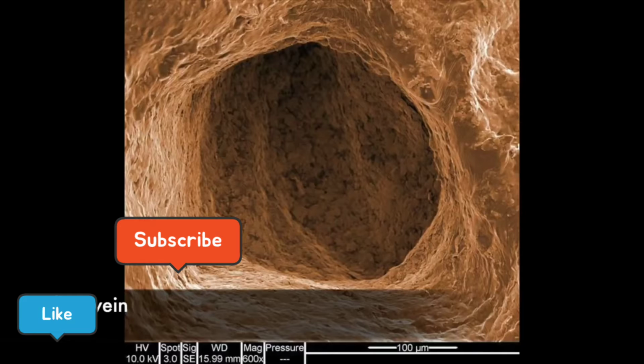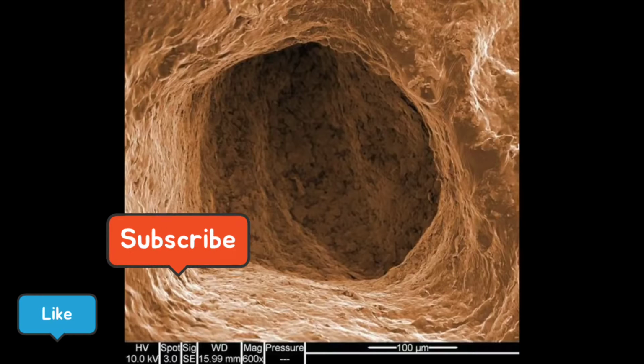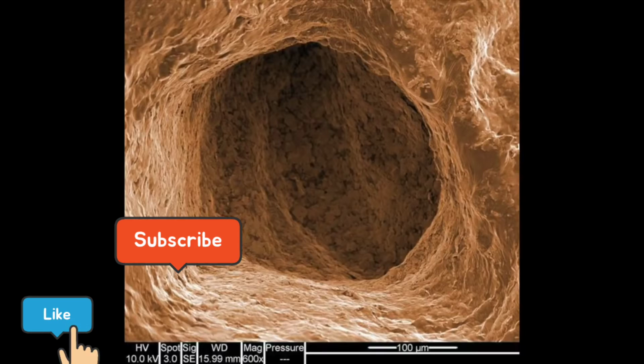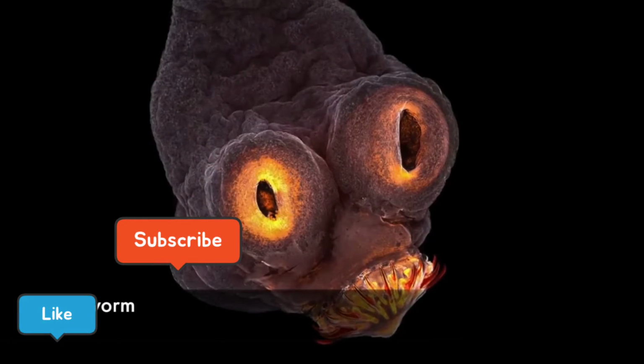This is a leaf vein. Veins are used to transport food and water throughout the leaf and also provide mechanical and structural support. Veins usually occur on the underside of leaves. A tapeworm.